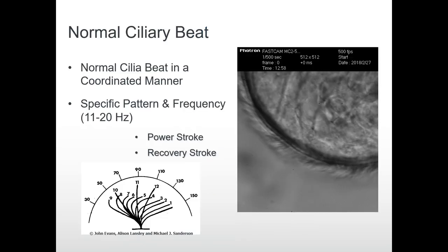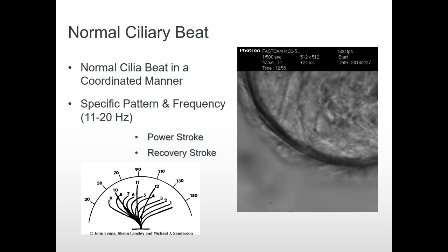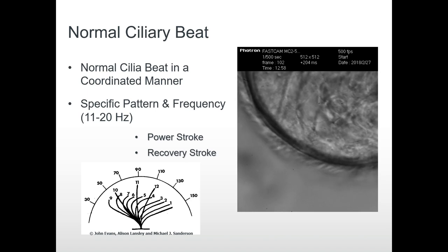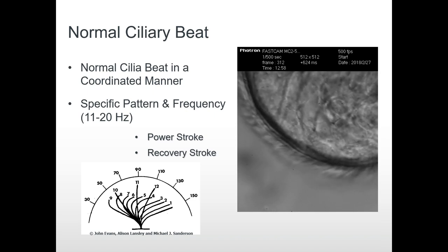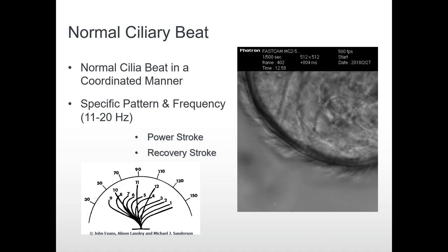In order to aid the movement of fluid, cilia beat in unison in a specific pattern at around 11 to 20 hertz. In this video here, we've got some cilia lining the edge of an epithelial cell taken from the airways, and we can see that they're beating effectively as we have little particulates in the bottom left corner which are moving along quite nicely.